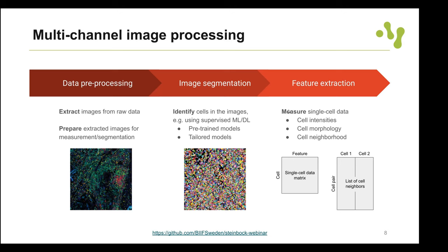Now that we have TIFF images, we should always look at them — are they okay? Does the analysis make sense? There are various tools for that: ImageJ, QuPath, TissueMAPS. I personally prefer using Napari, an image viewer used from Python. You'll find an example Napari script in the workshop GitHub page. I've already pre-run the script so we can look at one of these images.